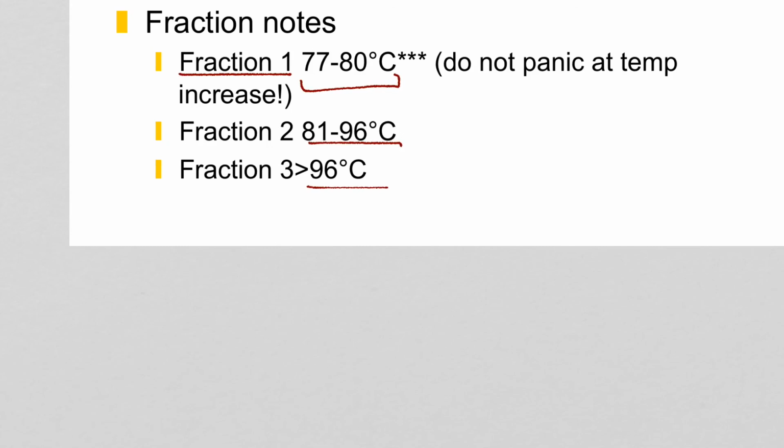Now the MIT video stated that you should discard the first few drops of the distillate, and that would be the first few drops of fraction 1. Do not do that. Just keep everything in fraction 1.